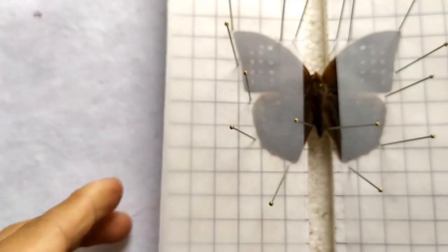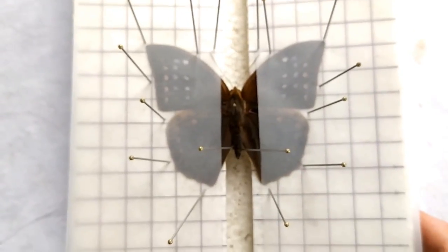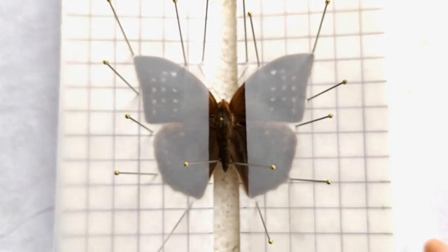The butterfly is now pinned and spread. Leave the spreading board in a warm, dry, and secure place away from insects and pests for a week or two to dry.